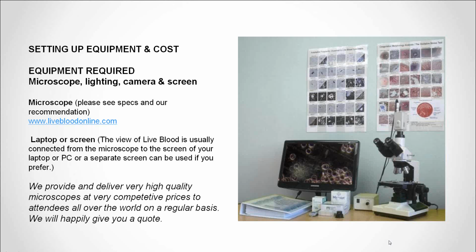So when you're viewing live blood, you're not just looking at a still image, you're moving around in the blood sample. And because of the poor frame rate with these cameras, you don't really get a very good quality video in there. And then also the software with these cameras are often not very user-friendly. The interface is not very easy to work with, so practitioners tend to get distracted by having to change settings on the software between the different applications in live blood analysis, going between bright field and dark field, for example, and that becomes a bit of a problem for them in their practice.